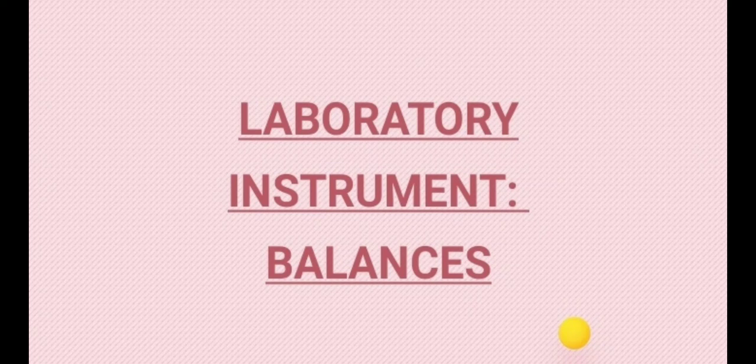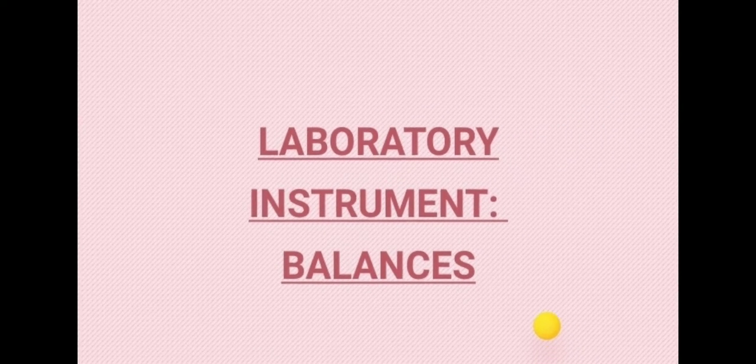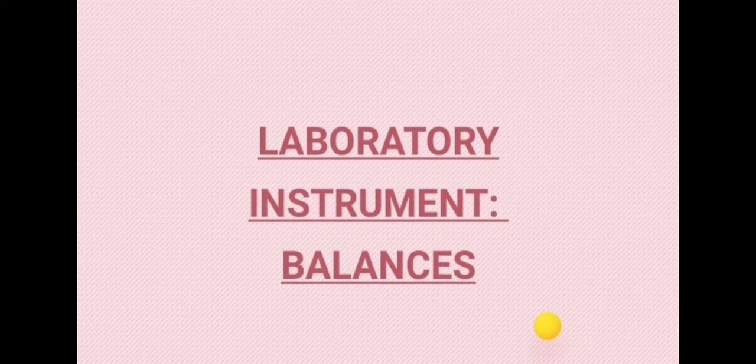Laboratory instrument: balance. Various types of instruments are used in the clinical laboratory, and their working is based on various techniques. Advancing technology provides the opportunity to make laboratory testing more accurate, fast, reliable, and cost effective. If the test results are to be useful to the physician in the diagnosis and the treatment of the disease, the test must be performed as accurately as possible with a short testing time.